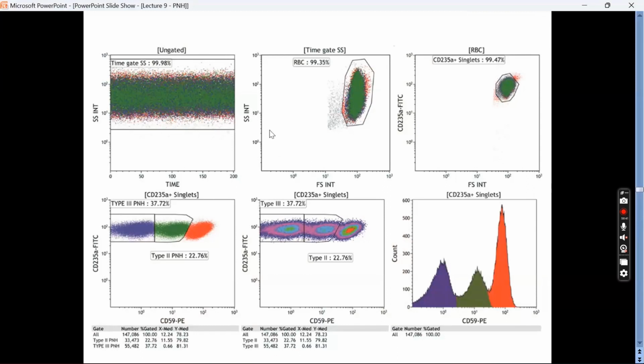You will be setting the threshold of forward scatter and side scatter in such a way for an RBC assay that you find only the RBCs. So WBCs will be out of scale, so that it will not get confused. Okay, sir. Any other doubts?